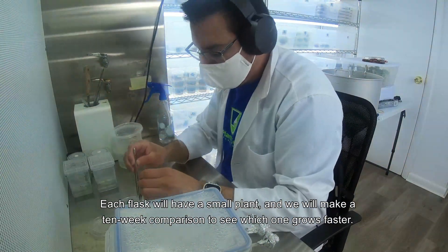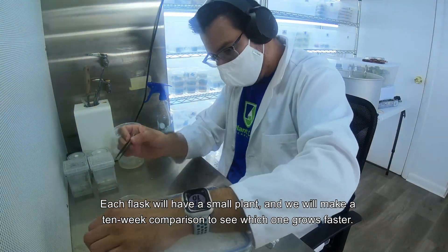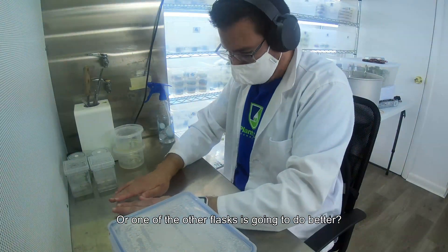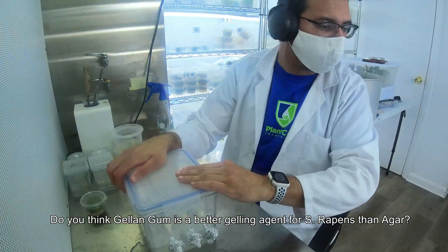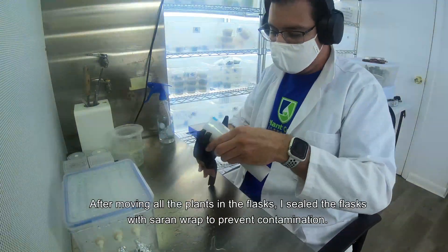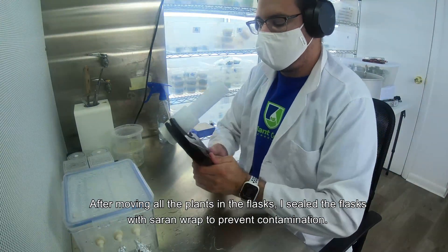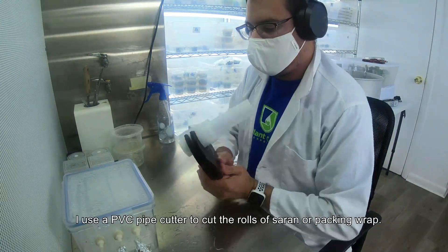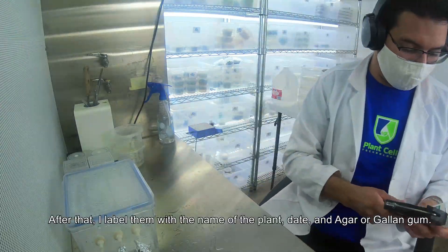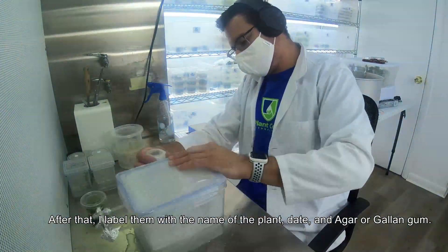Each flask has a small plant and we will make a 10-week comparison to see which one grows faster — will the plants in the temporary immersion bioreactor grow faster, or will one of the other flasks do better? Do you think gellan gum is a better gelling agent for S. wrappings than agar? Let me know in the comments. After moving all the plants into the flasks, I seal them with Saran wrap to prevent contamination, using a PVC cutter to cut the rolls of wrap. After that, I label them with the plant name, date, and whether it's agar or gellan gum.